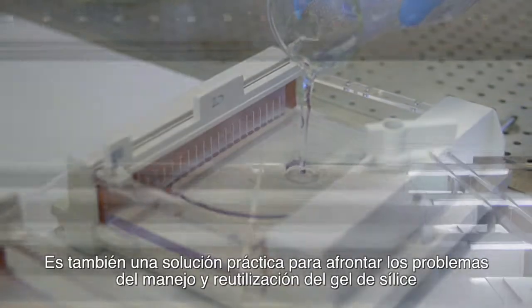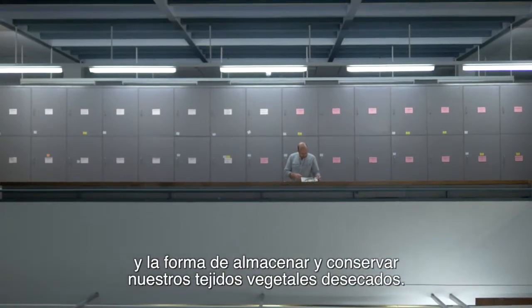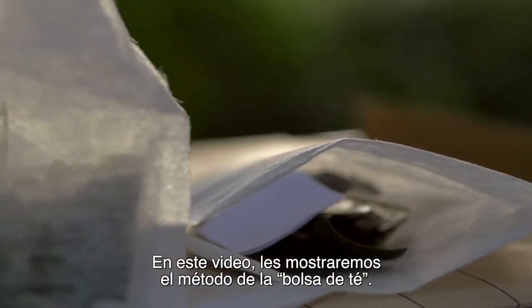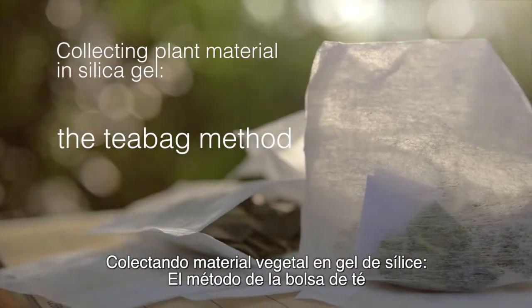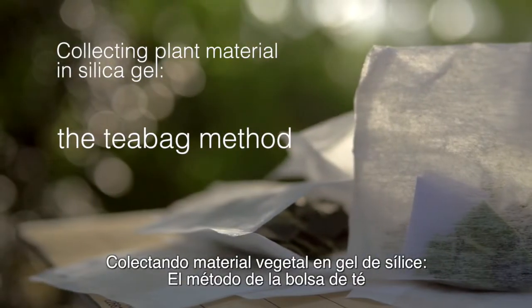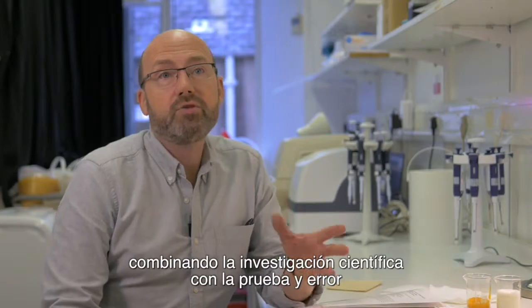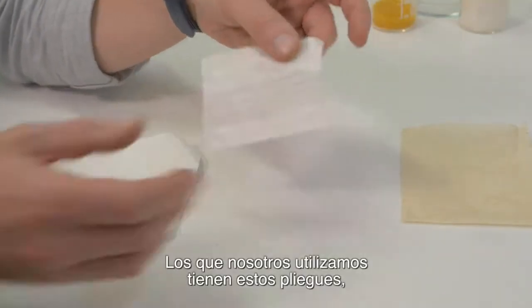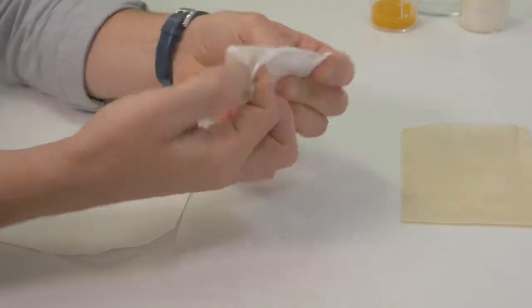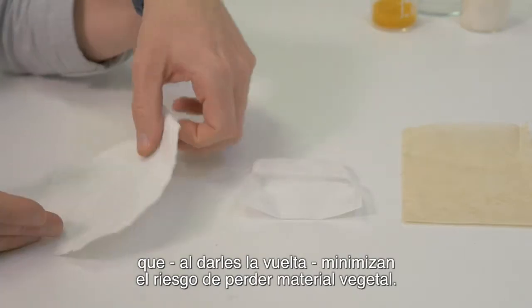It is also a pragmatic solution to dealing with problems with handling and reusing silica gel and the way we store and curate our dried plant tissue. In this video we are demonstrating the teabag method, which has been developed over several years using a combination of scientific research and trial and error. The ones that we use have folds in them which, when you turn over, minimise the risk of losing plant material.